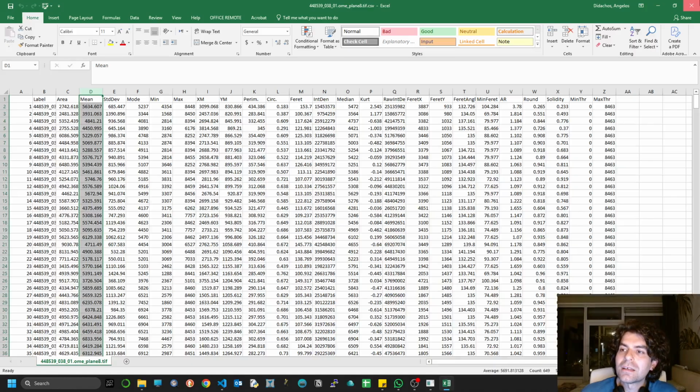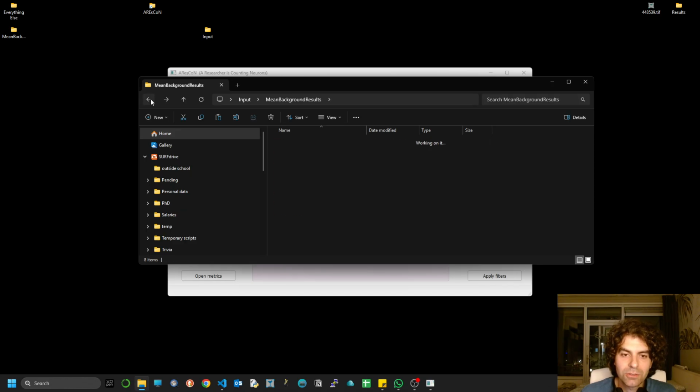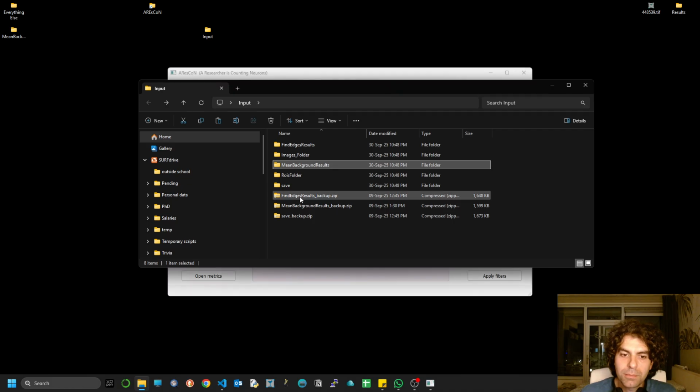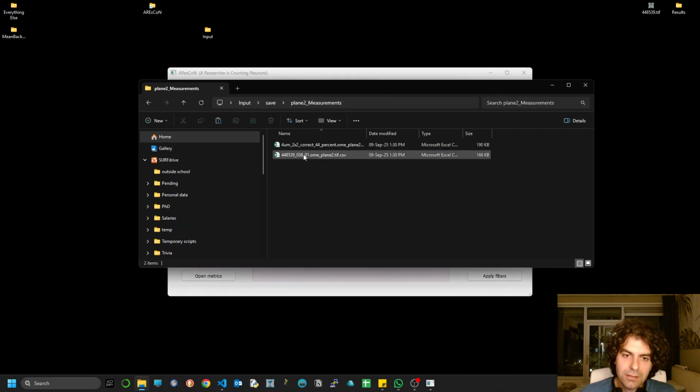Okay, and at this stage of the pipeline, this information is actually submitted automatically to the main measurement. So if you go to the main measurements here, and sorry, I've been using another file. I'm going to delete these very fast.